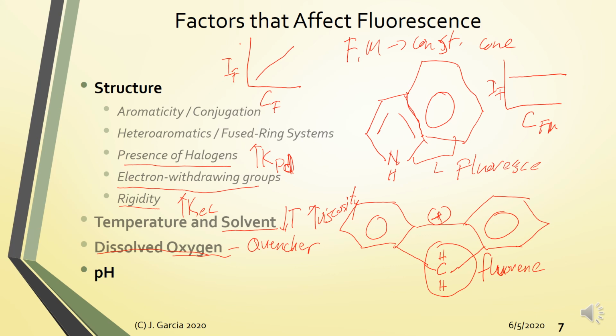Okay? Now, to analyze a quencher, what you do is, in separate solutions of this fluorescing material, you add an increasing amount of the quencher. And what will happen is that you will have a negative slope corresponding to the increase in the quencher concentration. And this will also follow a linear curve. It is still proportional, okay? Albeit inversely, because you have a negative slope. Alright? pH also affects the fluorescence.